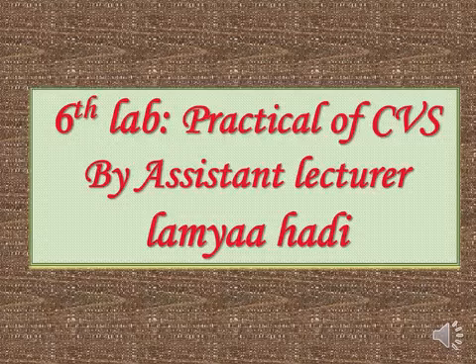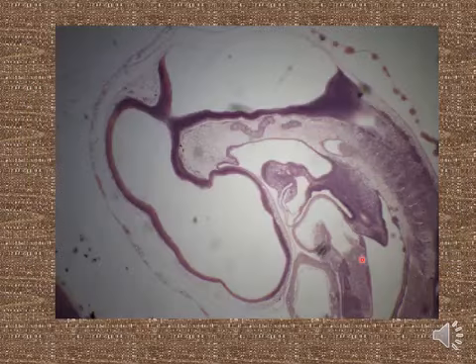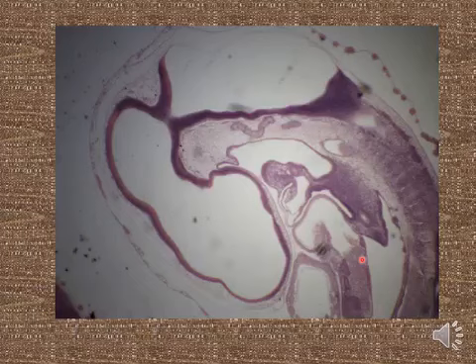In our lab today I will talk about the practical of the cardiovascular system. The first slide shows sagittal sections in the chick embryo, and these sections show the brain vesicles.